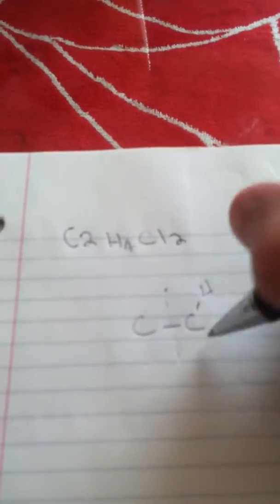C2H4Cl2, if there's symmetry, so if you draw your 2 carbons and our line of symmetry, basically both sides have to have the same thing. So we're missing 4 hydrogens. So if we put our 4 hydrogens in, again, they have to be symmetrical, and then add our 2 chlorines on each side. So again, if we were to fold it here, these 2 lines are symmetrical. That's why on the NMR you got 1 peak or 1 signal.